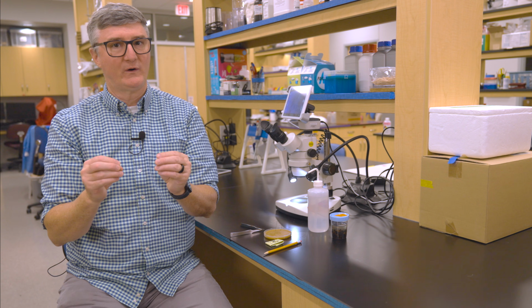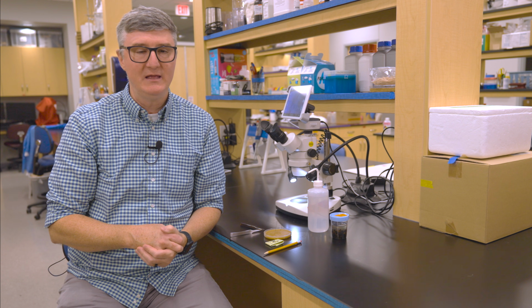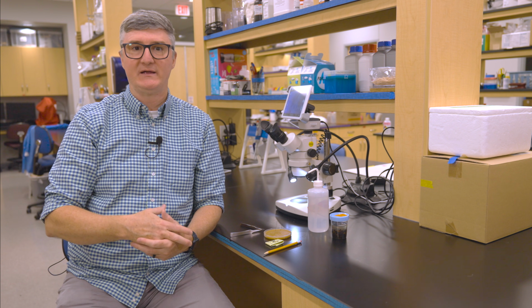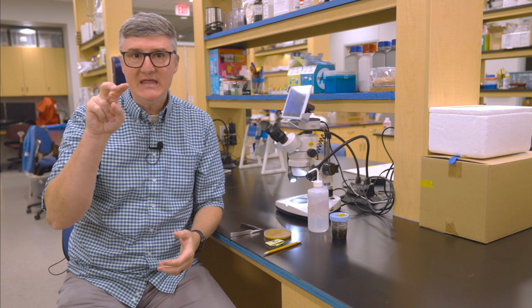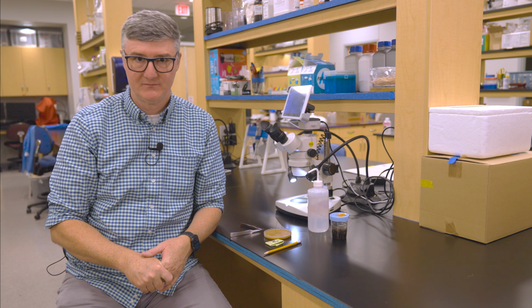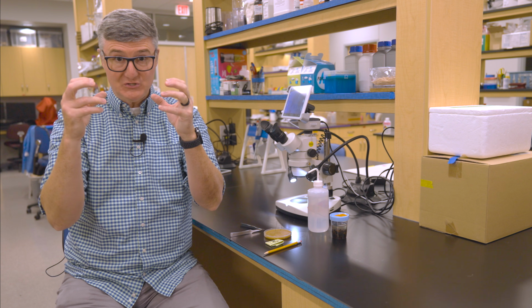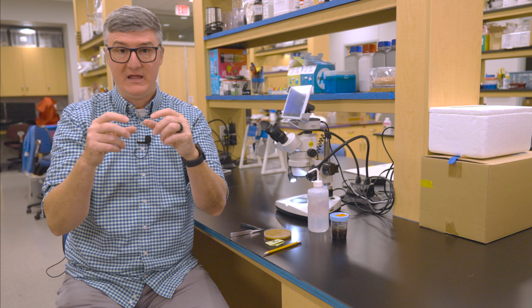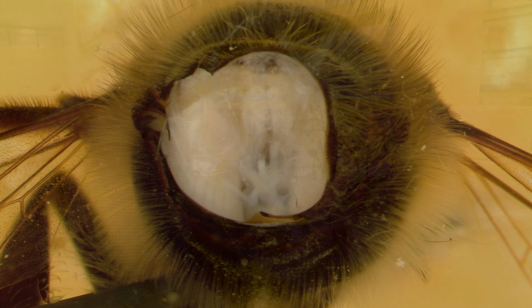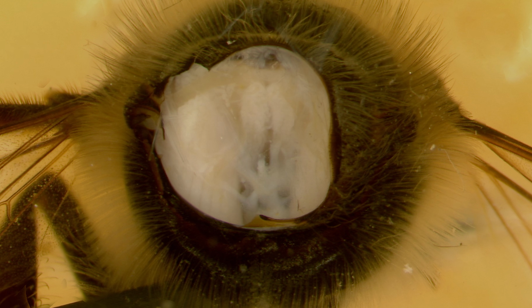Now with the legs of the thorax looking up to you, this is the trickiest part. A bee's thorax is composed of 3 different parts: the prothorax, the mesothorax, and the metathorax. Each of those sections has its own pair of legs. So the first pair of legs is attached to a piece of exoskeleton that has to be removed.